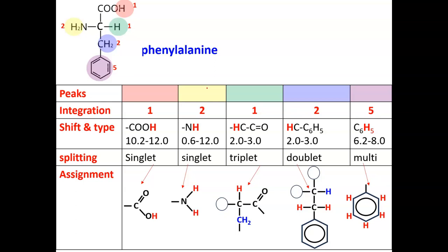So we've got a CH2 group on our benzene ring. Further on from that, we find we have a single H on a carbon bonded to a C double bond O group, just one of them. And that is our green shaded solitary H on the second carbon.